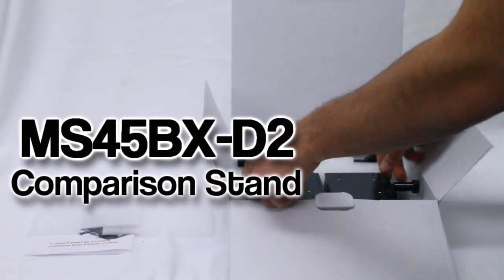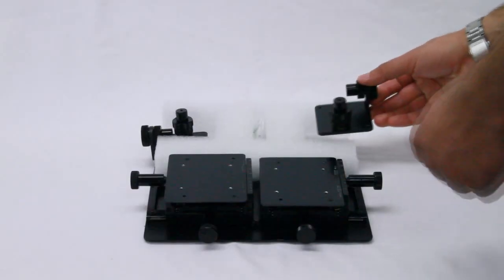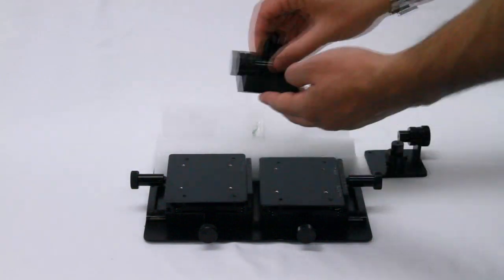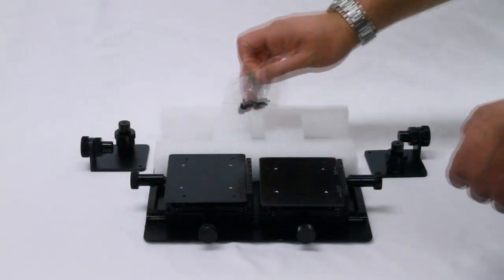Introducing the MS45BX-D2 comparison stand. This stand allows you to create a high quality digital comparison microscope.